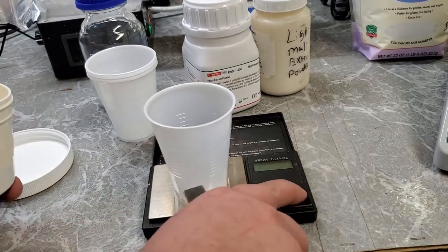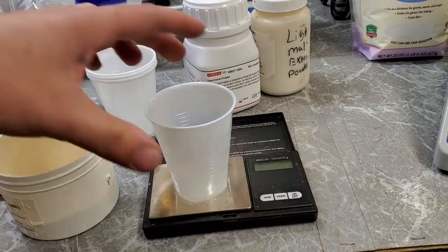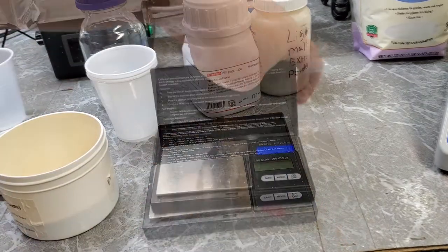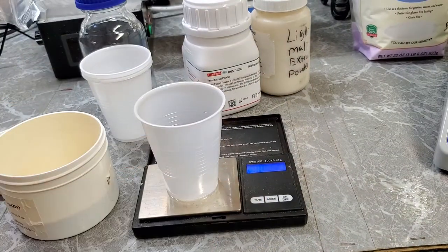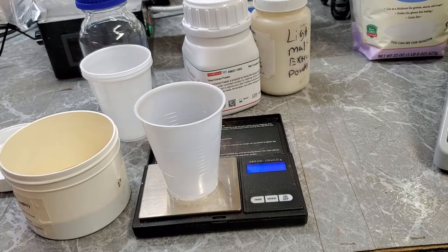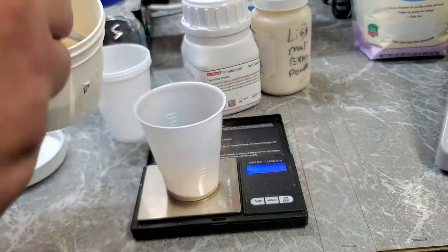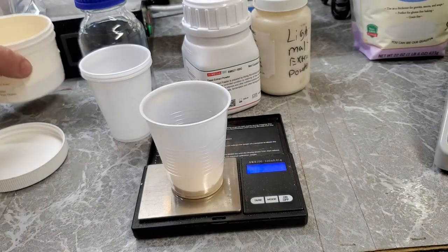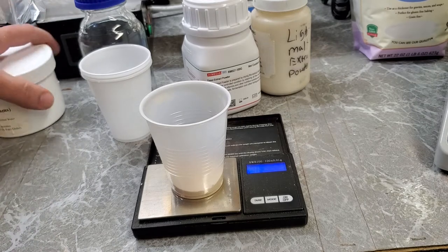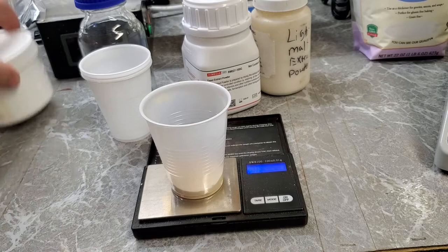Let me turn this on — my battery's dead. Hold on. New batteries installed. Okay, now I'm just going to weigh out 10 grams of this. I'll speed this part up so it doesn't take up a lot of time. 10.00 grams according to this little scale — I'll take that any day of the week.